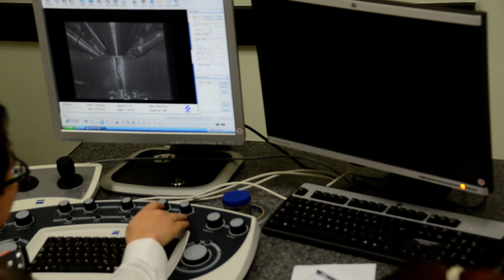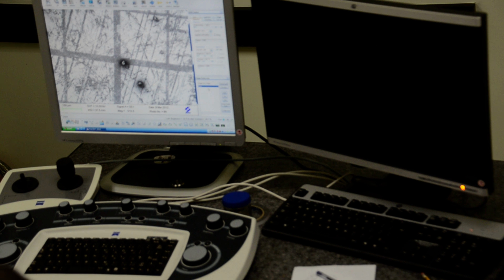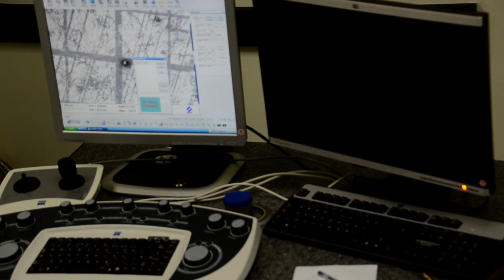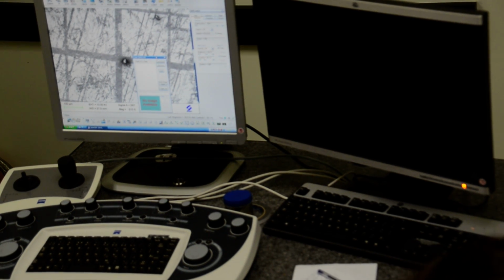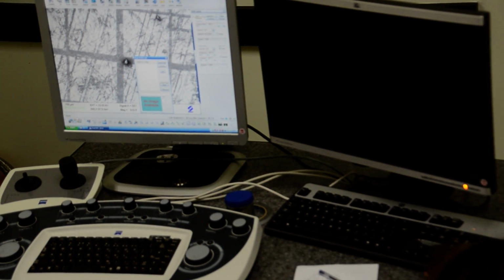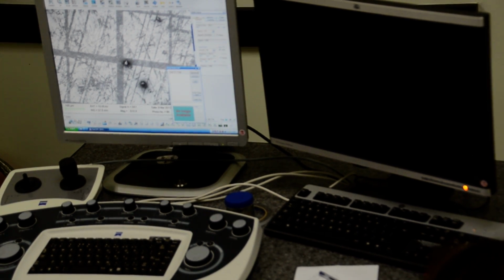So my suggestion is, because anyway you don't really want to test the sample again when it's loaded out, after use, delete it. If you create your own username and have your own user directory, these particular positions only belong to this user account. It's not messed up. You see just now how many positions are set. So that is what we call the stage save and record.